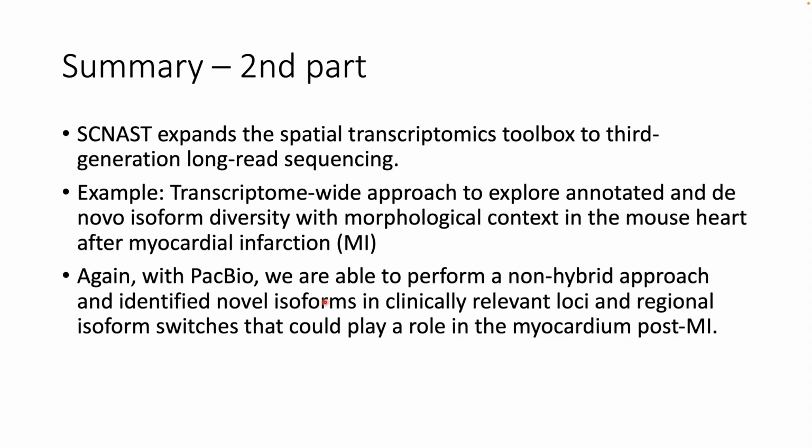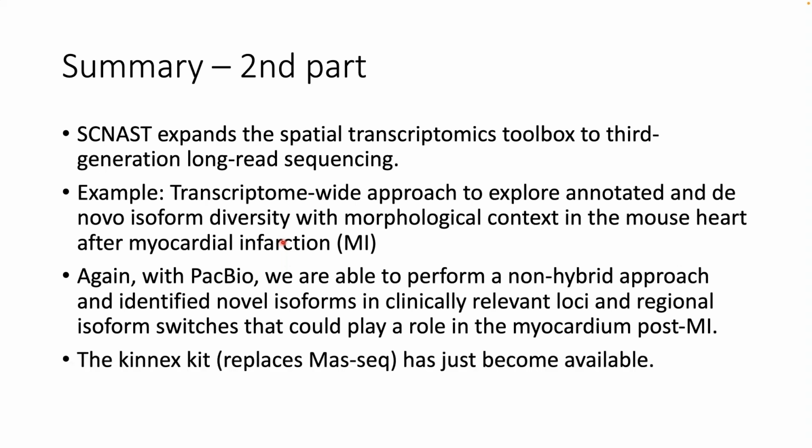Again, with PacBio, we were able to perform a non-hybrid approach, and we identified several isoform switches that are happening partially in clinically relevant loci. That is very interesting if you have a spatial heterogeneity in the heart and if you want to study that. So that is basically what we can enable and provide you with.